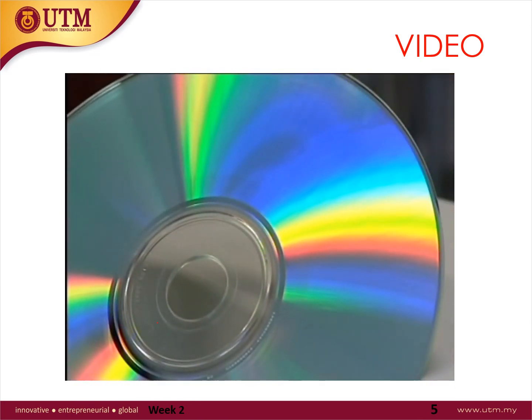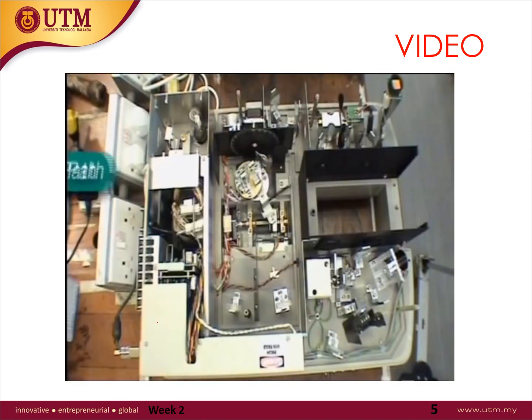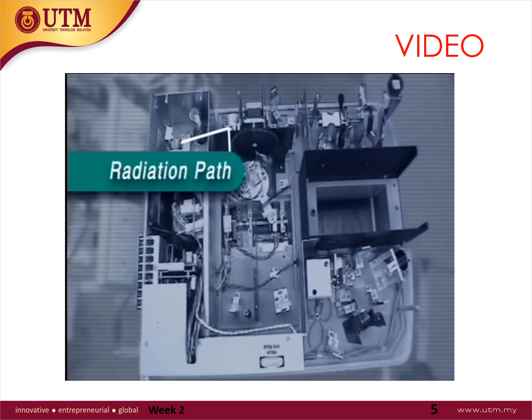Different wavelengths correspond to different colours. Red is about 700 nanometers and blue around 400 nanometers. Wavelengths shorter than about 350 nanometers are called ultraviolet. Shorter wavelength light has higher energy. The source produces white light that includes all wavelengths, all colours. The instrument scans through the spectrum, sending different wavelengths of light through the sample in sequence. This is done by the grating, which rotates.